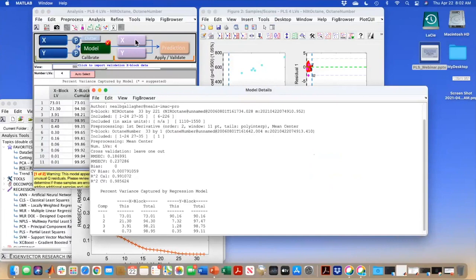Just like we had out here. The thing is that if you have a Y block, you can then test your predictions. And that's what we refer to as the validation step. Great. And if you're doing an online environment, you're essentially doing just the X block, right? Right.